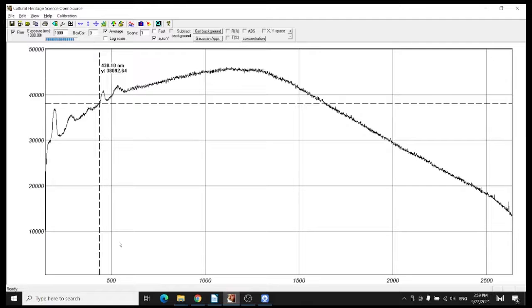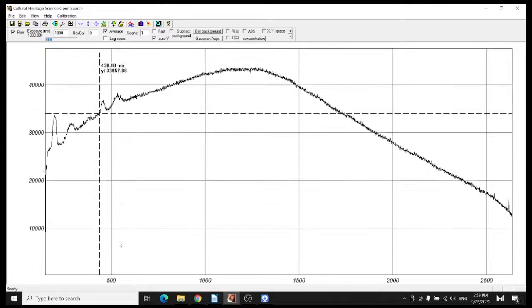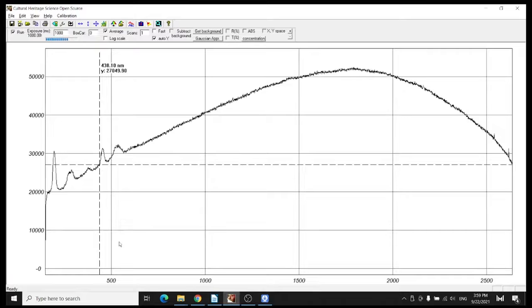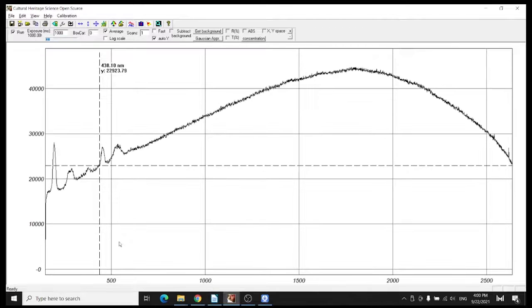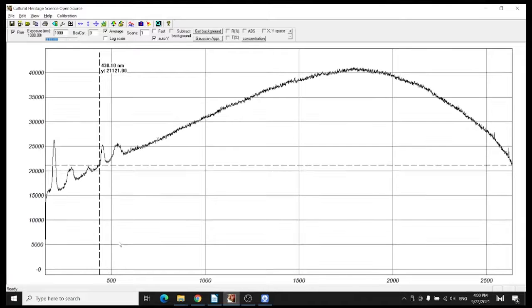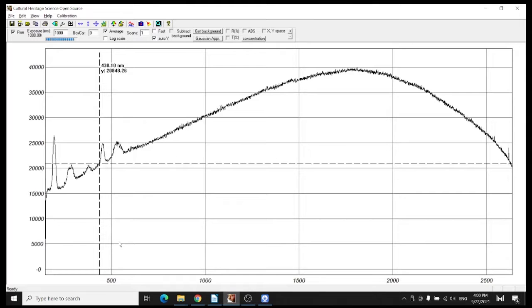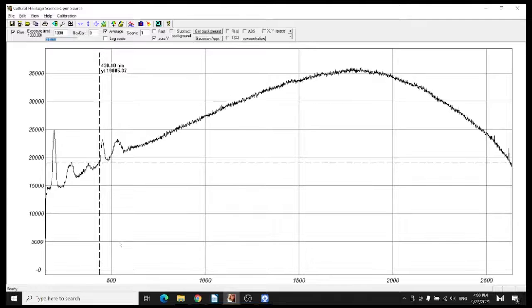You see, for example, now it's getting much better. We see the peaks much clearer. Now the peaks are more visible. There is a lot of fluorescence, so we see this large curve that is almost going to saturation at 60,000 counts. There is the saturation, but definitely we are able to see the peaks for lead tin yellow.